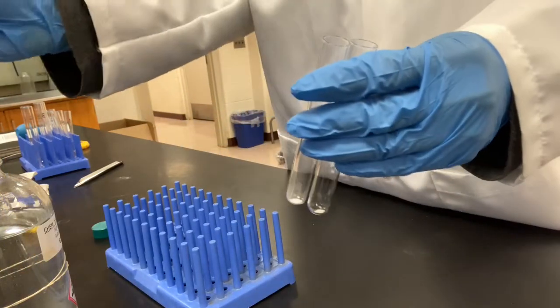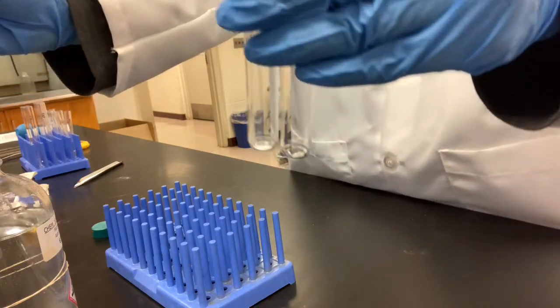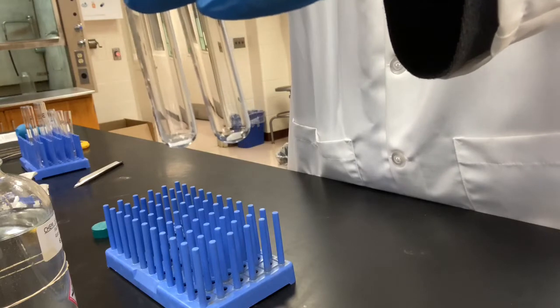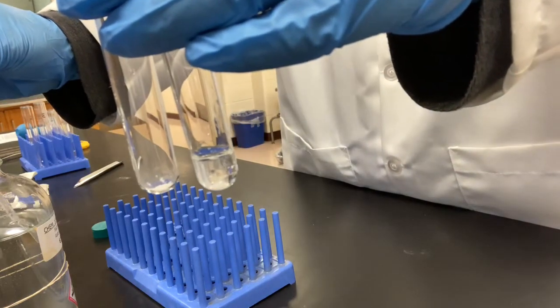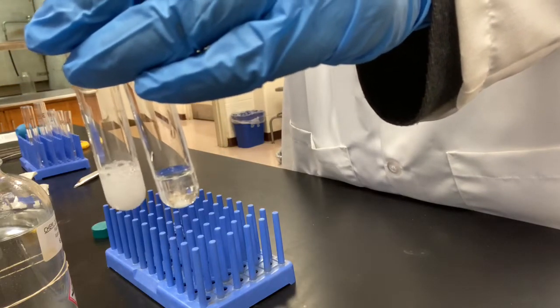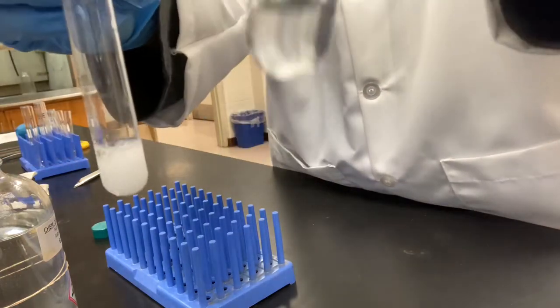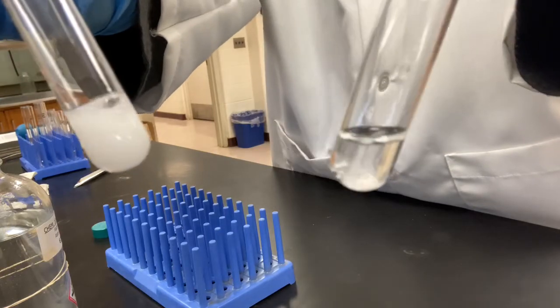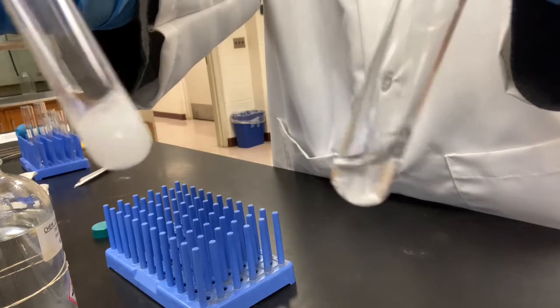All right, I'm gonna add about 2 mL of hydrochloric acid to each one of these. First one goes to the chips. Second one goes to the powder. Wow, you see the difference right away. This is a chip, this is powder. Clearly shows us greater surface area, the reaction goes faster.